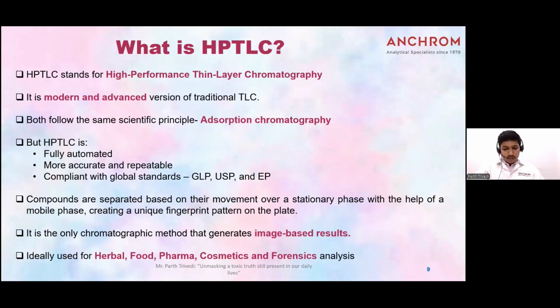So, what is HPTLC? As I'm saying continuously, HPTLC is high performance thin layer chromatography. It is a modern and advanced version of TLC. Both depend on adsorption chromatography only, but HPTLC is completely automatic and accurate. You can do repeatable analysis, and it complies with global standards like GLP, USP, and EP.